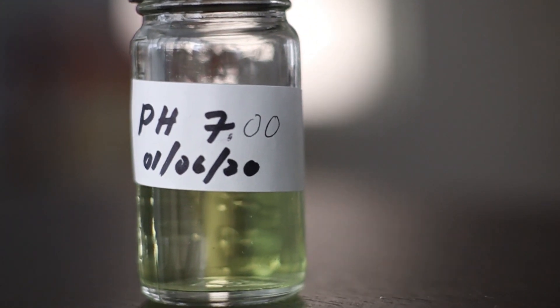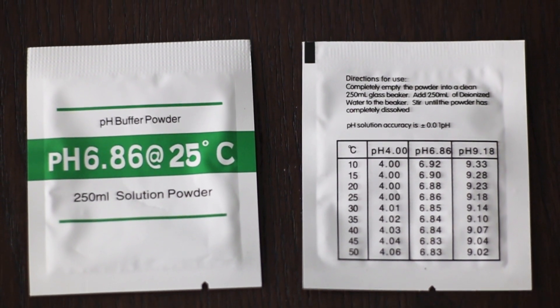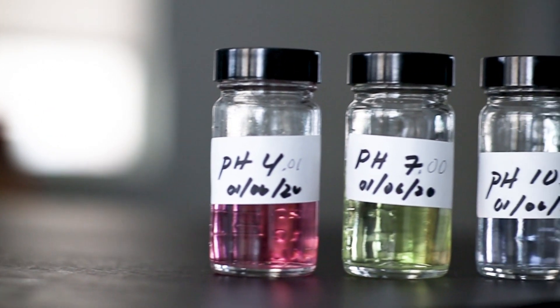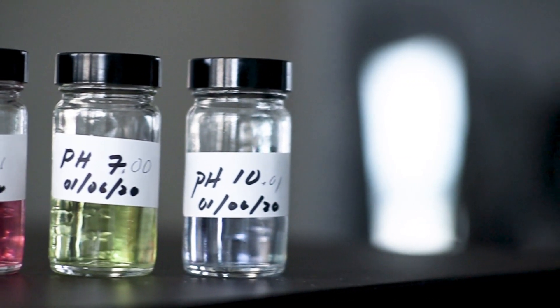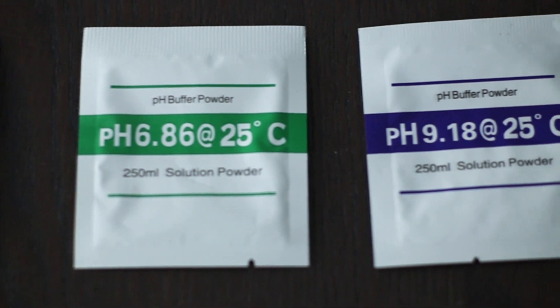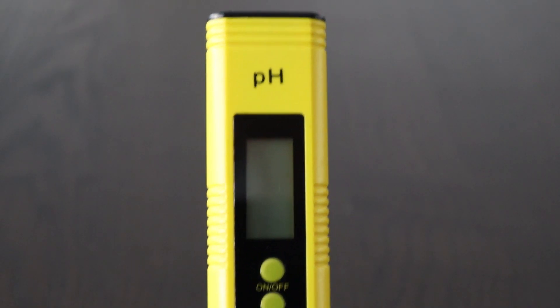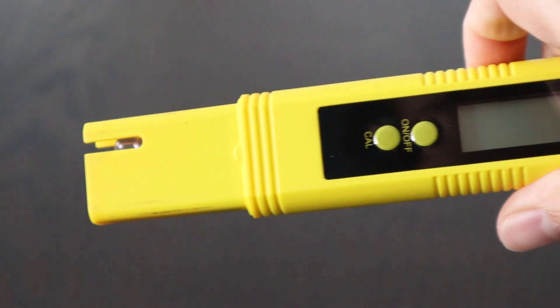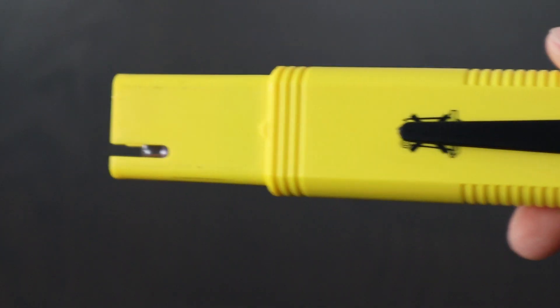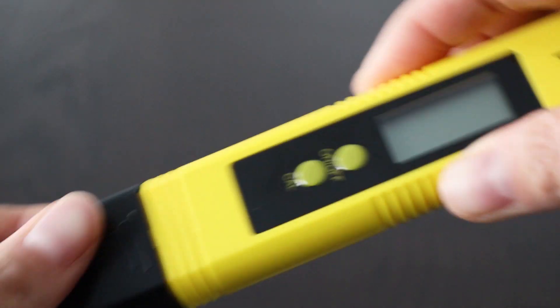If I were to get a new pH meter, I would not purchase this one. The calibration powders are a little tricky to use and I'm not sure I'm getting accurate readings. I would prefer a meter that calibrates to pre-made pH standard solutions of 4, 7, and 10 — that way I know the solutions are completely accurate and I wouldn't have to mix powdered solutions and guess if I've made them correctly. Those meters tend to be more expensive — instead of this cheap $20 meter, I'd probably need something in the $50 range and up. But for now I'm okay using this meter, and until it starts to drift terribly, I'm not going to change it.